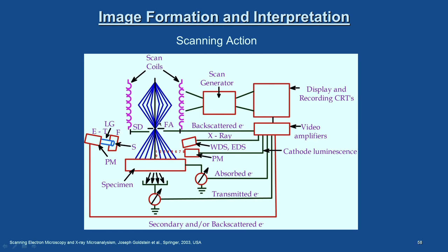instrumentation details once again. You look at the schematic, and most of the parts we have already discussed, but today we will just see the functions of each of these instrumentation parts and its action during the SEM operation. With respect to the scanning action, we will discuss the response of each part of this equipment.